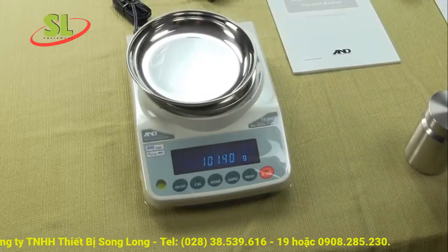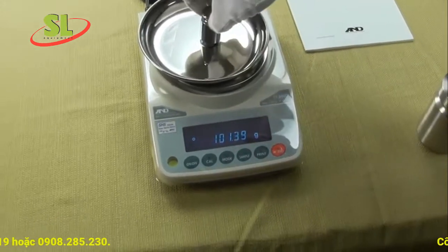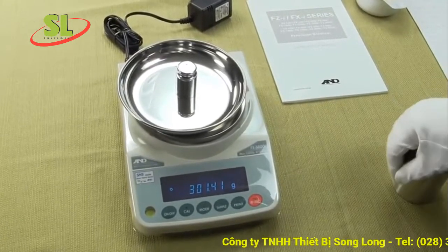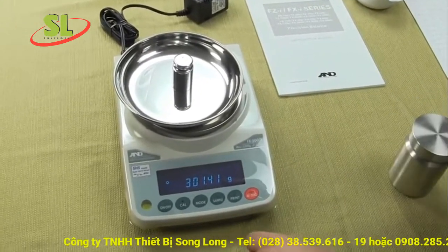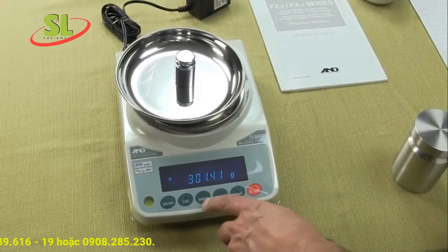This balance weighs up to 5200 grams by a hundredth of a gram. You can see the balance has a nice blue vacuum fluorescent display, and you can weigh in multiple weigh modes simply by pressing the mode key.